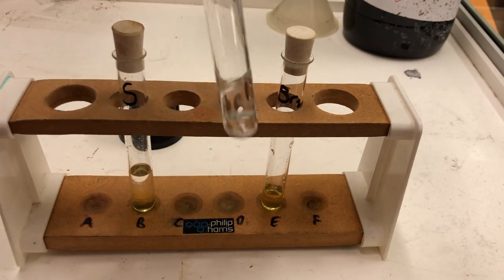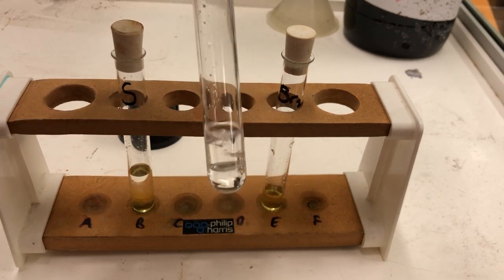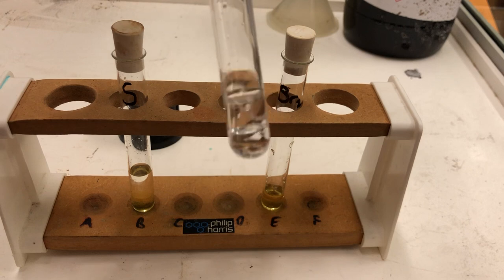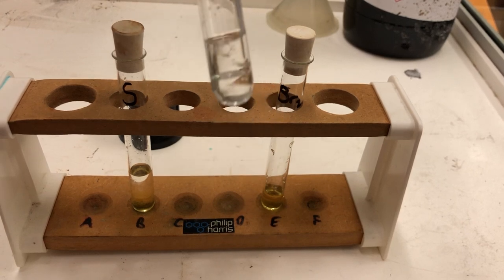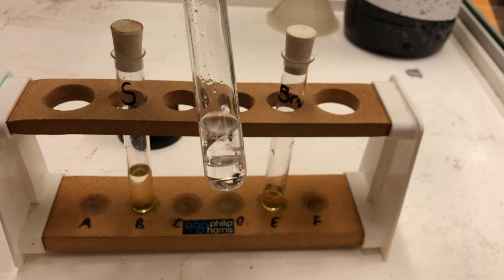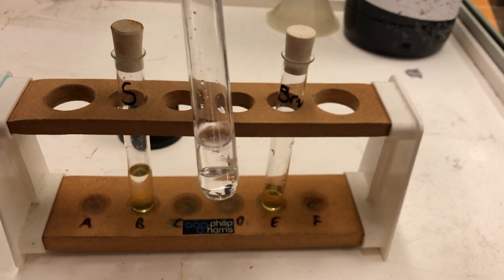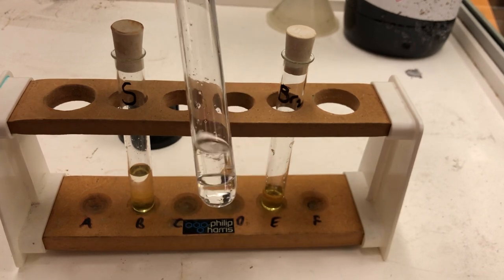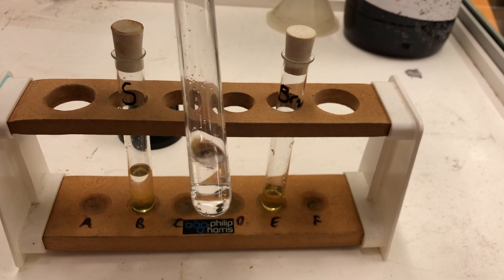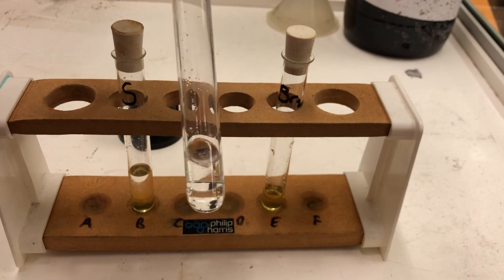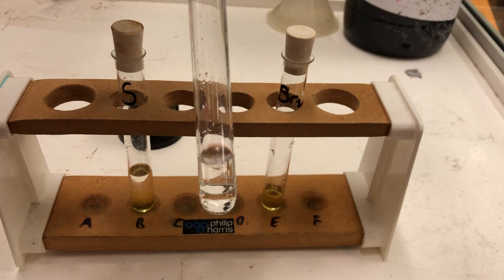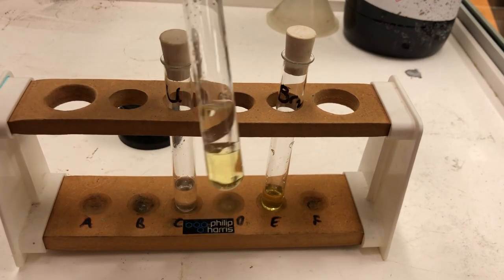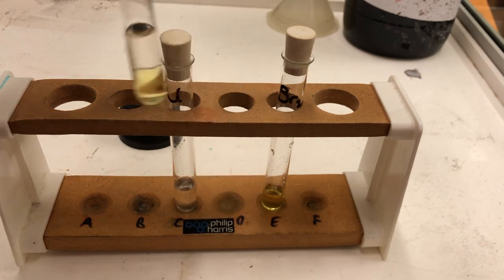However, when bromine is added to an unsaturated hydrocarbon such as hexene, again the bromine water is lying at the bottom here. You can see the two layers, and the bromine water has decolorized. It has lost its yellow color and it is now clear and colorless. Bromine reacts with unsaturated hydrocarbons such as hexene but does not react with saturated hydrocarbons such as hexane.